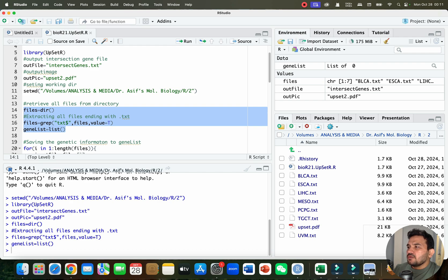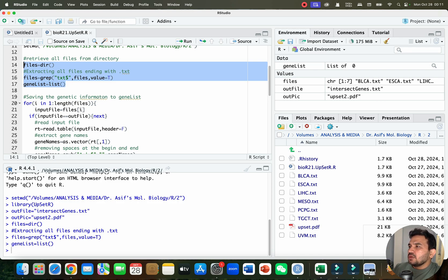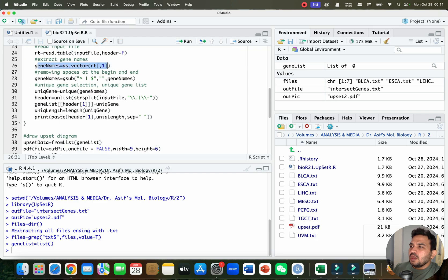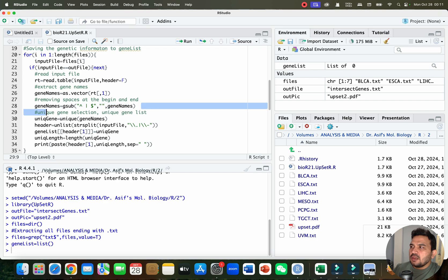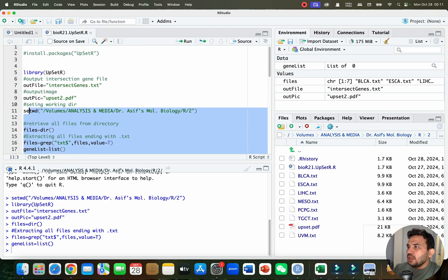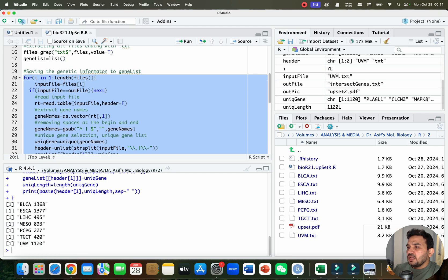Now we need to save the genetic information in the form of a gene list. We will read the input file, extract the gene names, remove any spaces, and then create unique gene names. I will select all this code and run it together to save the genetic information as a gene list. You can see it has saved the list.